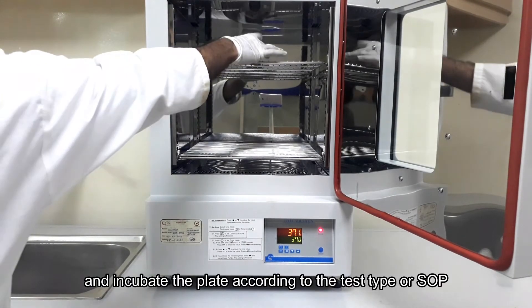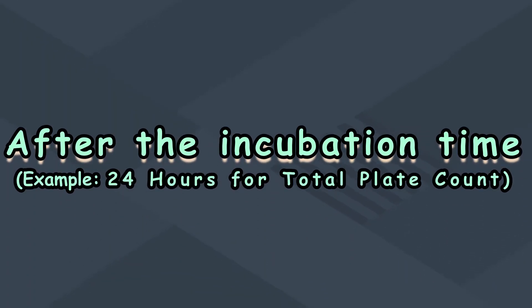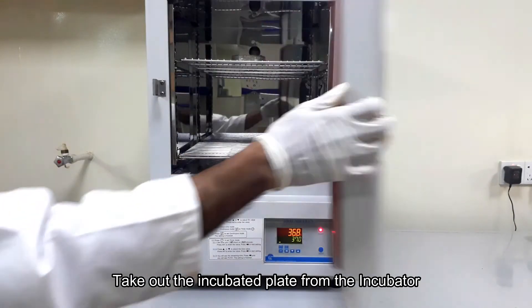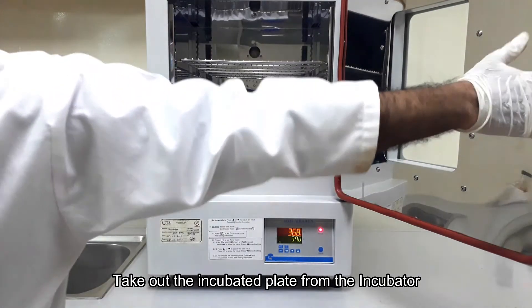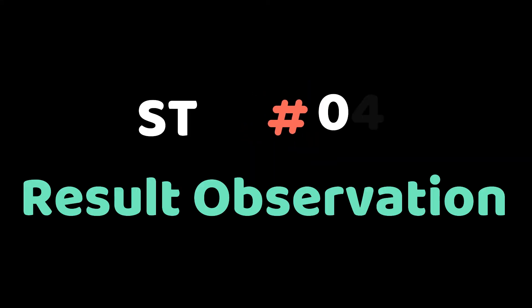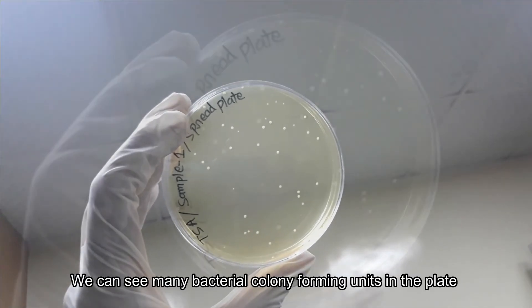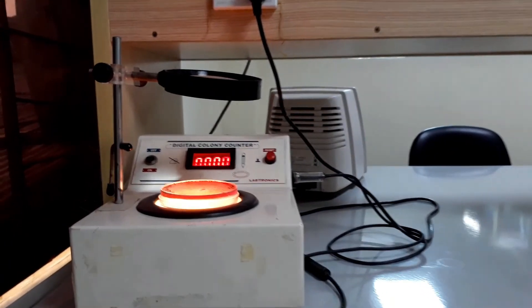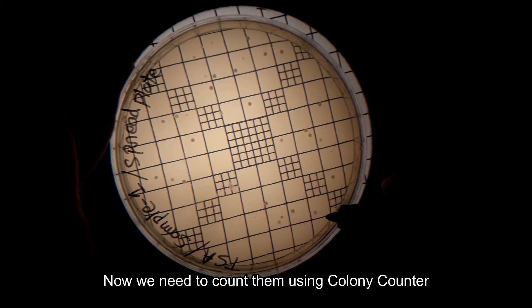Invert and incubate the inoculated plate under appropriate growth conditions according to the media used and microorganisms tested. After the incubation period, take out the plate and observe the result under the colony counter. You can see many isolated colonies of bacteria in the cultured plate. Now count each of the colony forming units to interpret the result.